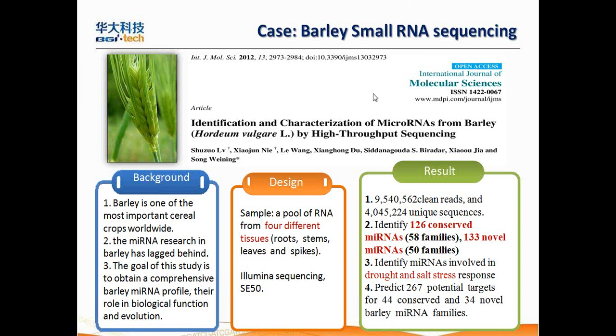And here is a case of small RNA sequencing that investigates barley. Some background information about barley: it is a very important cereal crop, and there is not much investigation of microRNA in this species. And this is the design of this project.